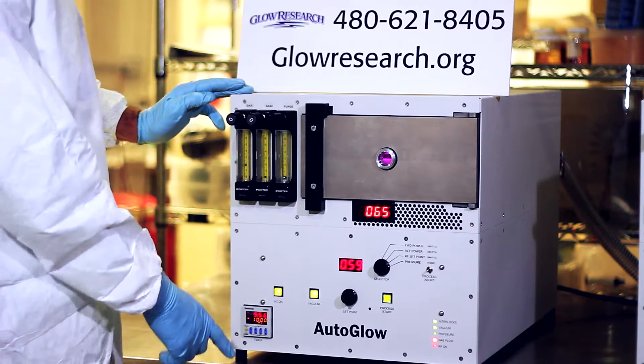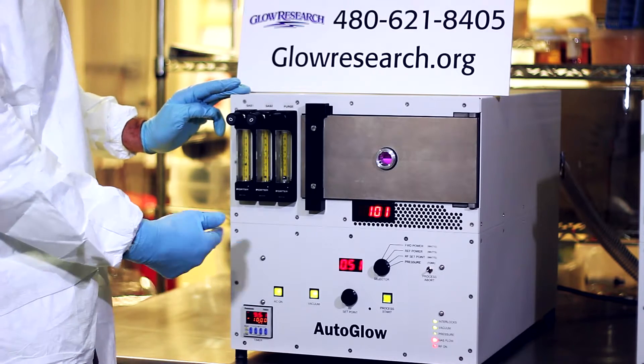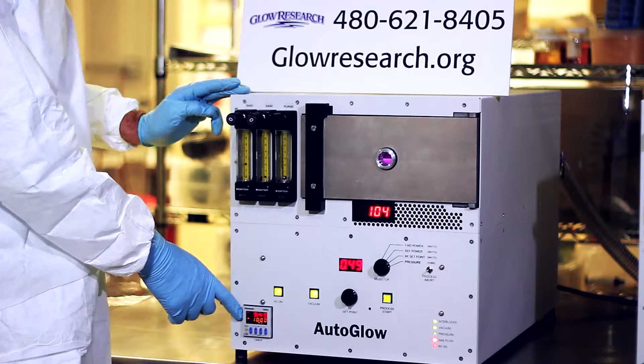The system has automatic tuning — no manual tuning required. The typical process envelope is 0.5 to 1.2 torr.